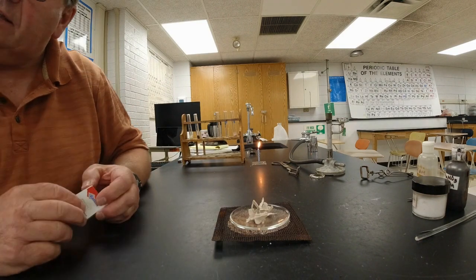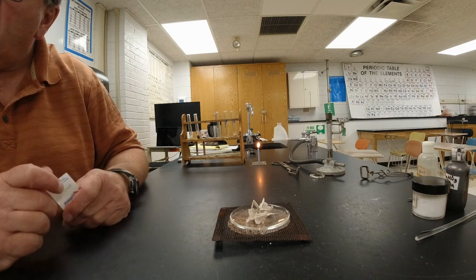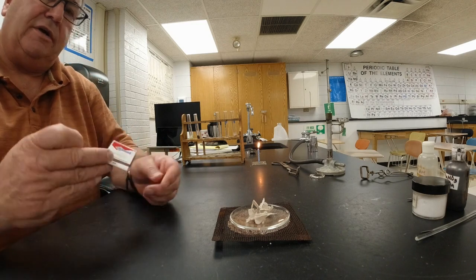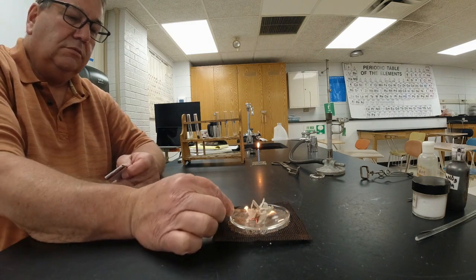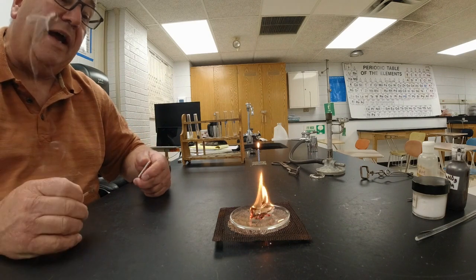Then what it says is to set the paper towel on fire and just let it burn. So here comes some burning paper towel. All right, you see light coming from it.